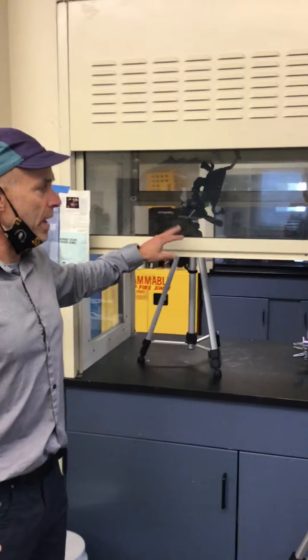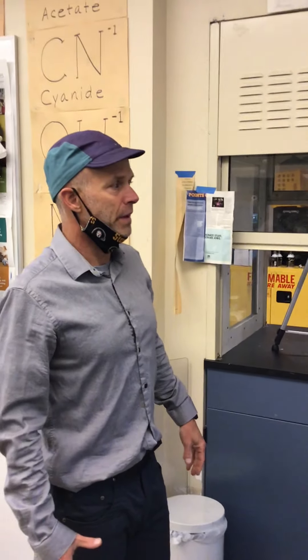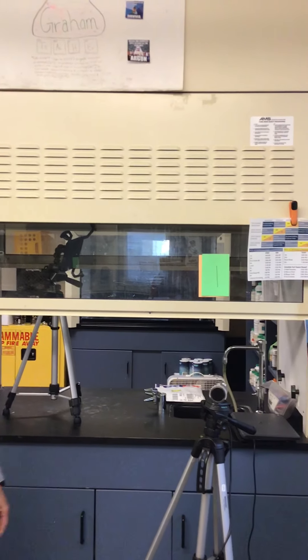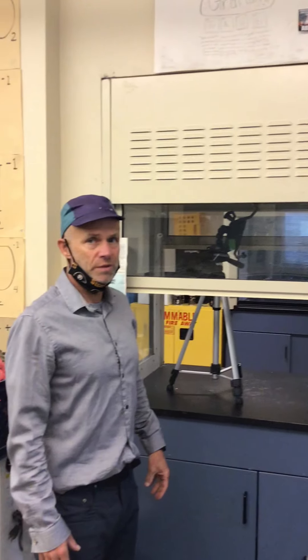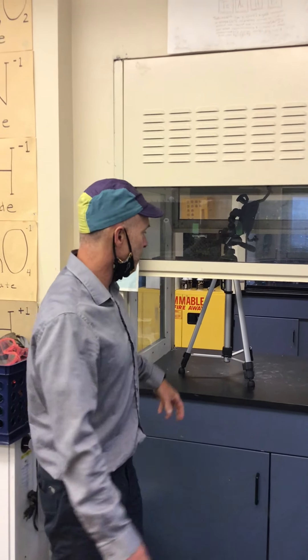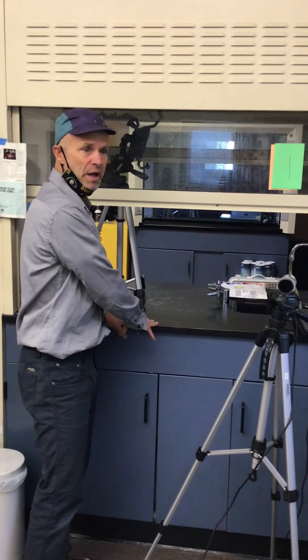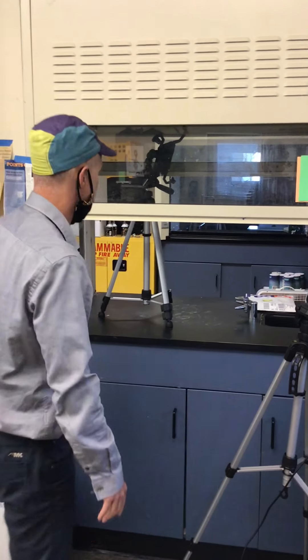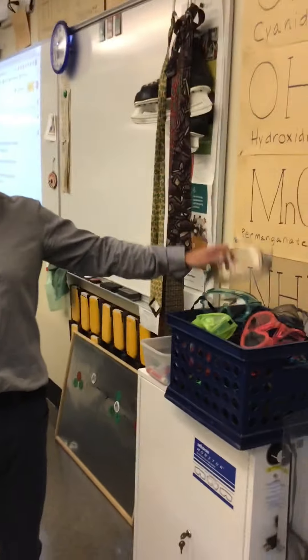We have the fume hood. We turn on the fume hood especially when we are making volatile gases. The fume hood will pull those gases up and out of the building. Also, if we're working with chemicals that liberate a lot of gases, we'll work in here.